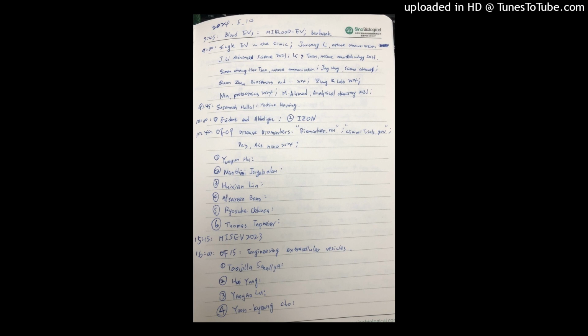This is the method. Comprehensive CNV status was analyzed by whole genome sequencing, while the CNV status of specific genes was analyzed by droplet digital PCR, which is characterized by high precision and sensitivity. 30 genes were selected as the target gene panel for ddPCR analysis based on the ovarian cancer moonshot database.